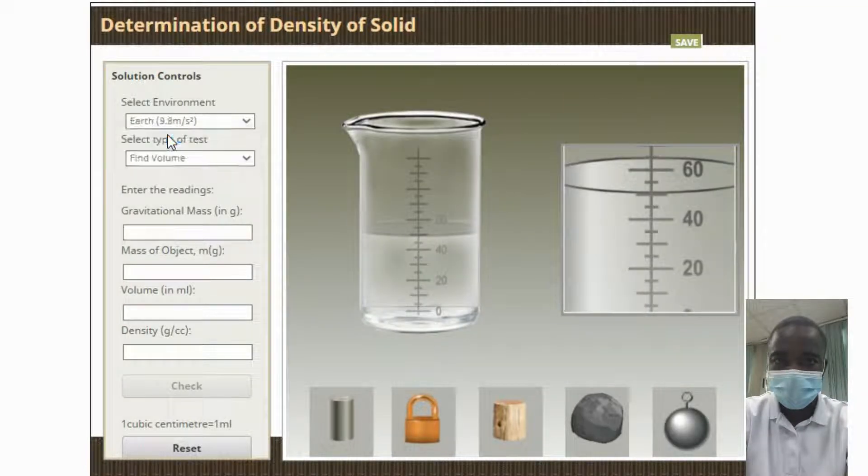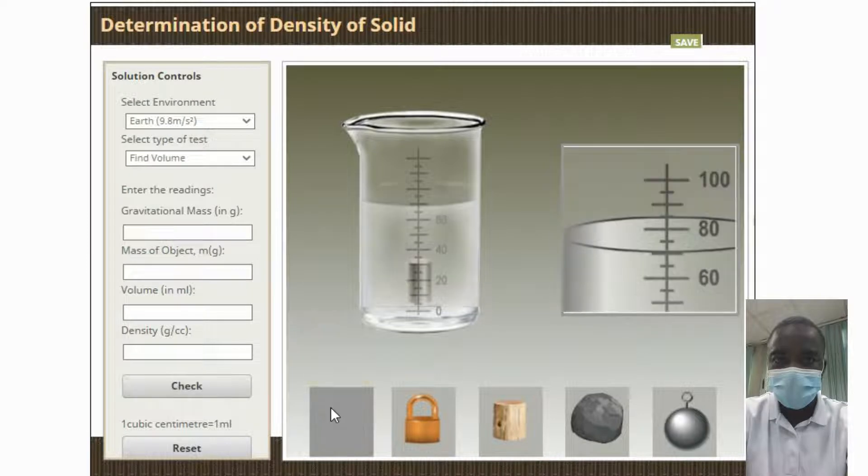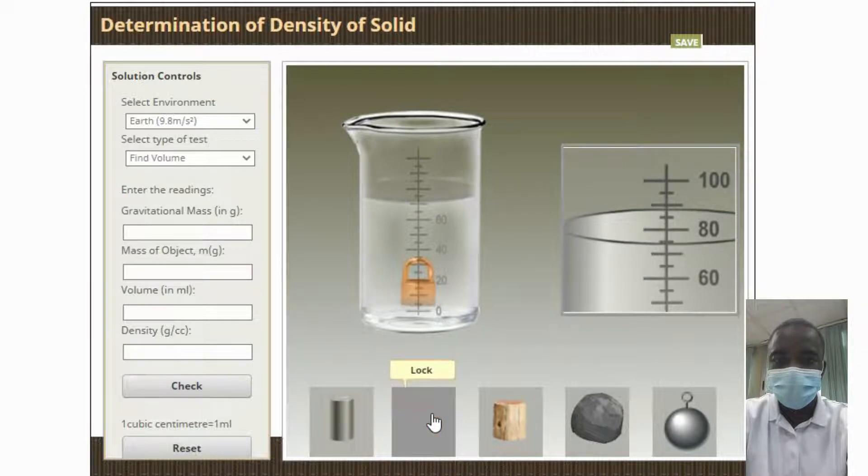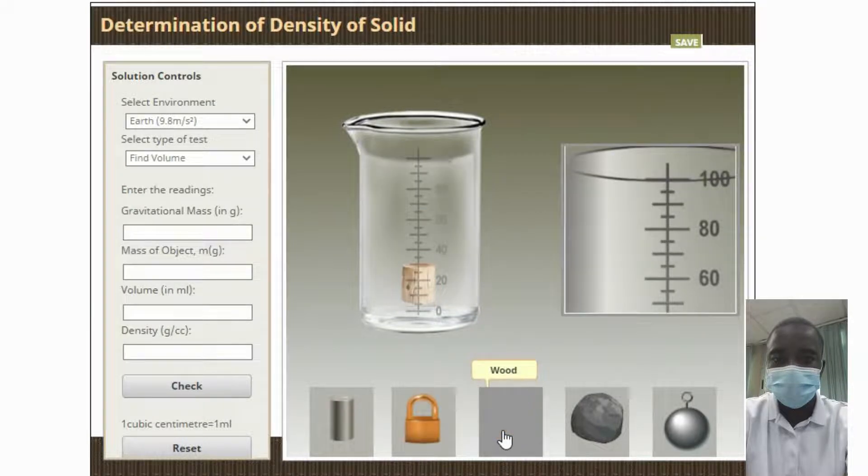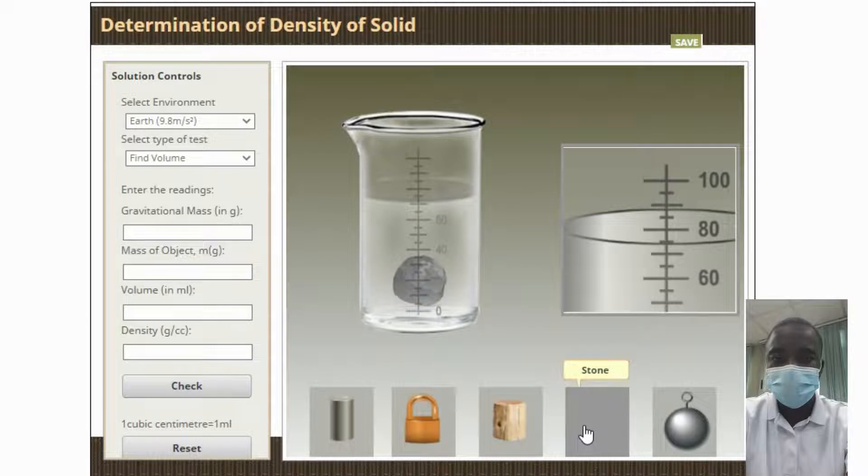The density of a solid can be determined using a variety of methods, depending on the size, shape, and composition of the solid. The most common method is to weigh the solid and divide by its volume. This can be done by measuring the dimensions of the solid and calculating its volume, or by submerging the solid in a known volume of liquid and measuring the displaced volume.